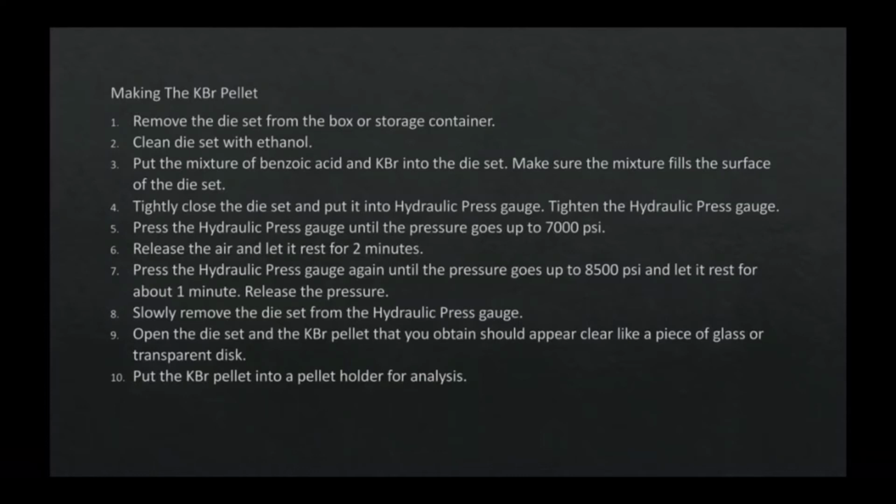Press the hydraulic press until the pressure goes up to 7,000 psi. Release the air and let it rest for about 2 minutes. Press the hydraulic press again until the pressure goes up to 8,500 psi and let it rest for about 1 minute. Release the pressure. Then slowly remove the die set from the hydraulic press. Open the die set, and the KBr pellet that you obtained should appear clear like a piece of glass or a transparent disc. Then put the KBr pellet into a pellet holder for the analysis.